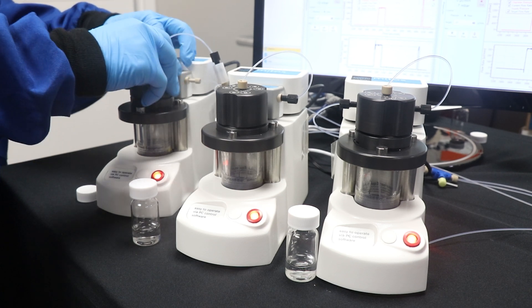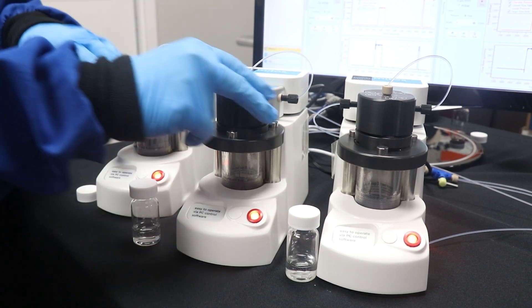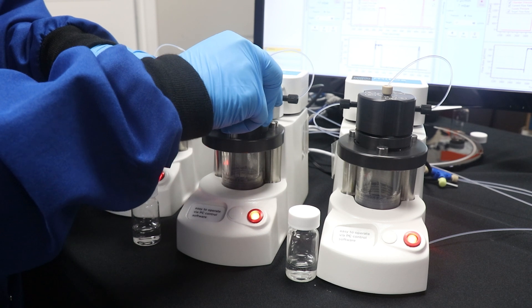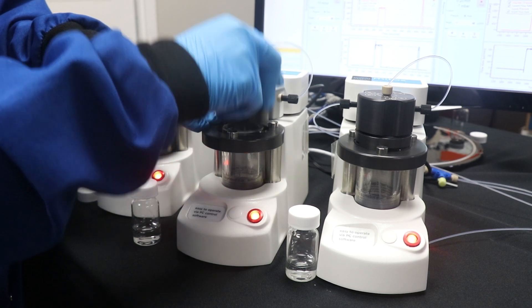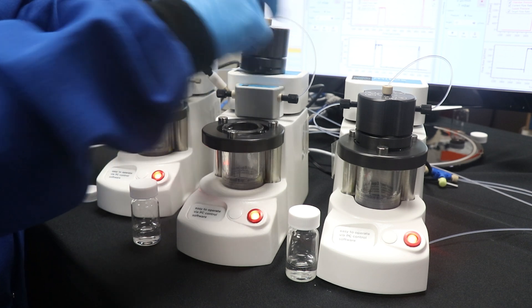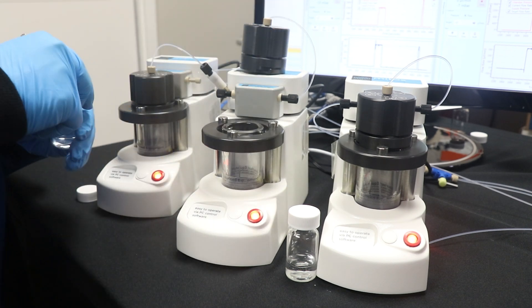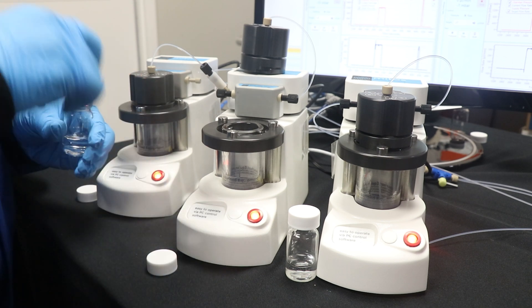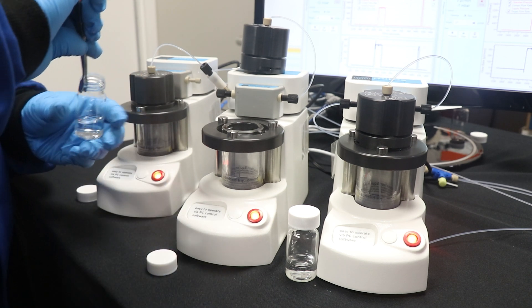For more information on lipid nanoparticle formulation composition, we have another LNP Tech Talk, which we will link down below. The next two solutions are the same. Our aqueous phase contains nucleic acids in a buffered solution. The composition and pH of the aqueous phase should be evaluated and will be specific to the composition of your LNPs.